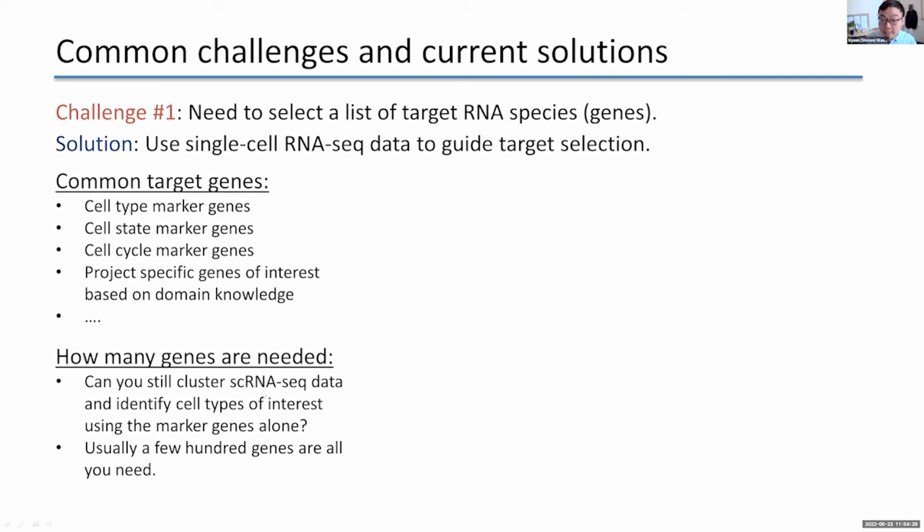All right, so with the single-cell RNA-seq data, if you include all the genes from the seq, you will be able to do the t-SNE, the UMAP, the clustering, and you see these different clusters of cell types using the full data set, right? If you remove all the other genes and just retain your marker genes that you selected, can you still identify those clusters and do this t-SNE UMAP plot and see those cell types using the single-cell RNA-seq data?